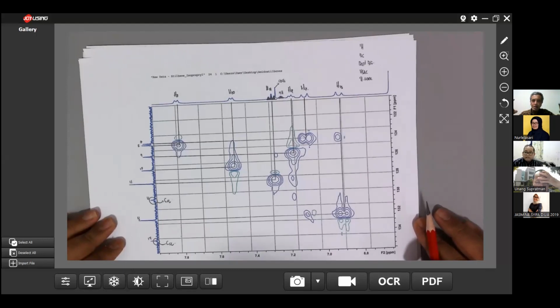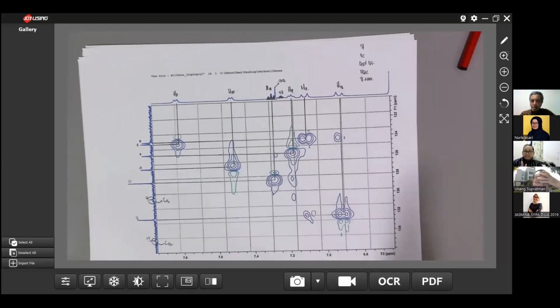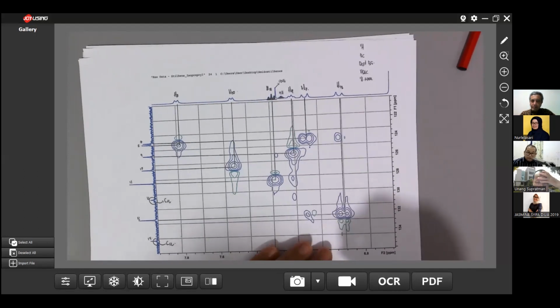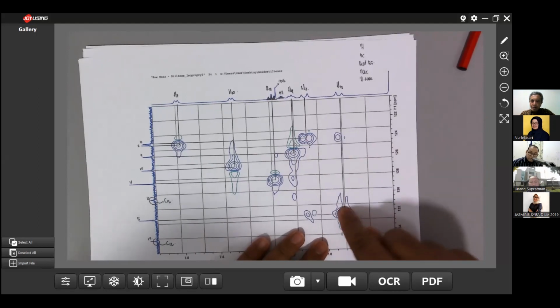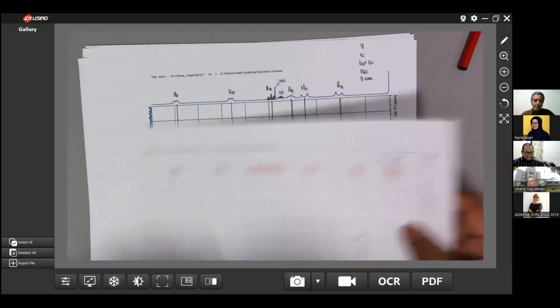It's not impurity, it's a satellite actually. Sometimes they are reflected. It means the proton and its carbon are near each other. It depends on the intensity. If we talk about the intensity, this will be the real protons, the correlation here, and this one will be for this level. So that's the satellite, yes. Yes, 124. Okay, all right. Thank you, Pavin.